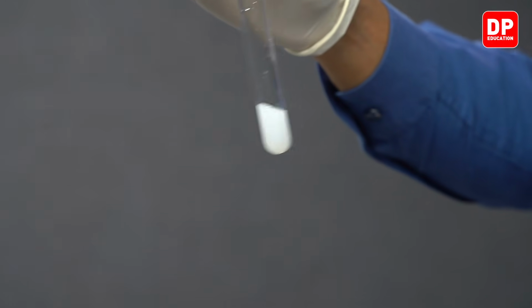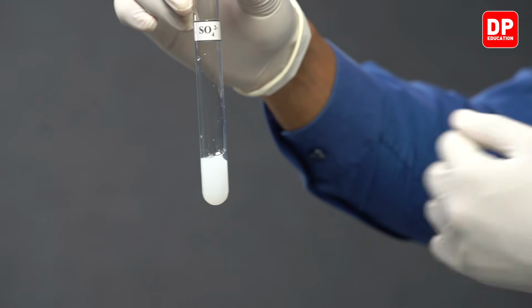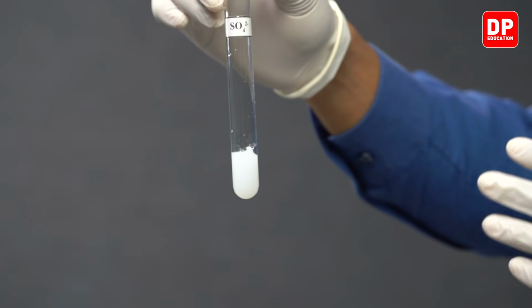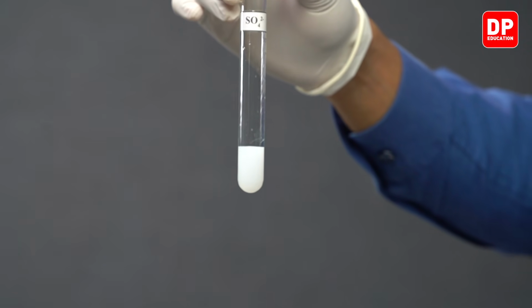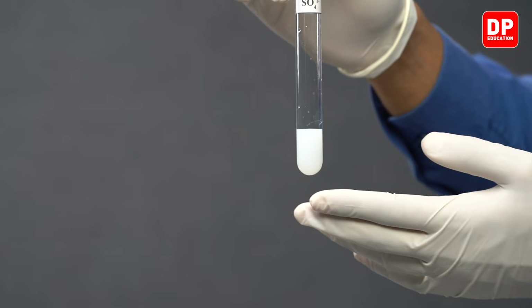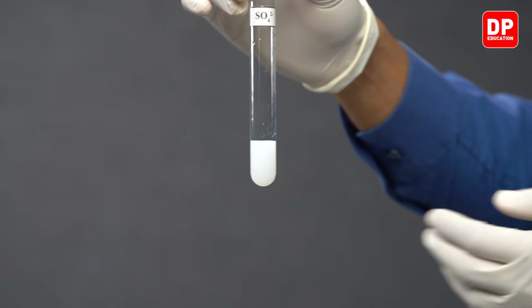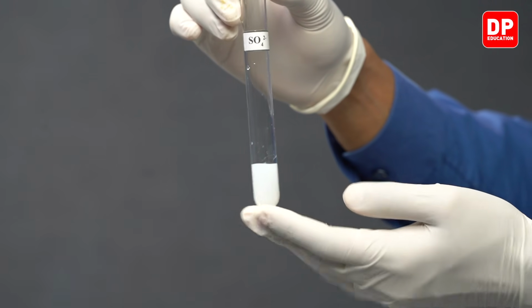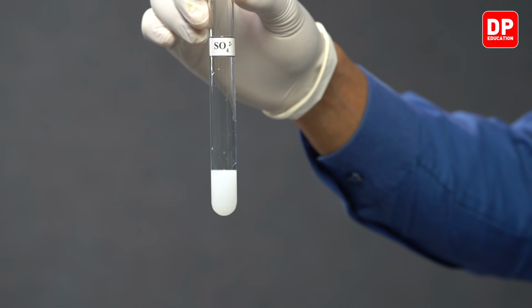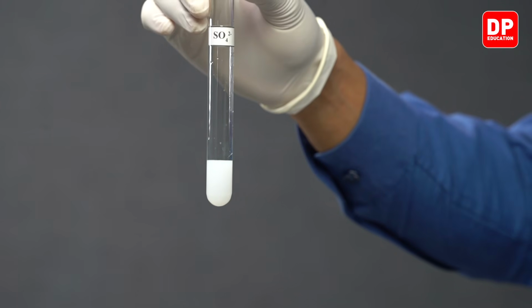If I shake it, I can very clearly observe that the white precipitate that was formed will spread throughout the aqueous medium and will form a suspension. Over here, what we have formed is barium sulfate. Barium sulfate is water insoluble. So you can observe this white precipitate dispersed throughout the aqueous medium, and the medium is now white in color. That is due to the barium sulfate precipitate that is dispersed throughout it.